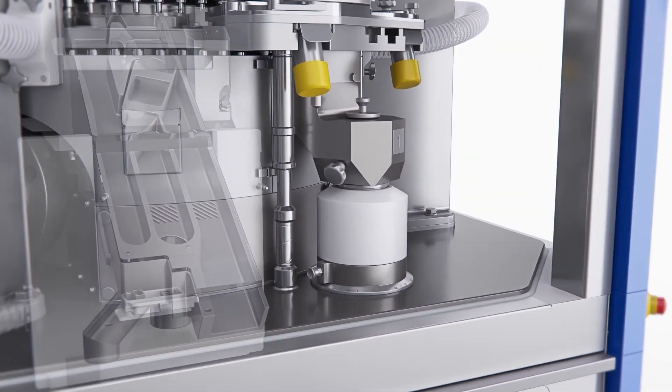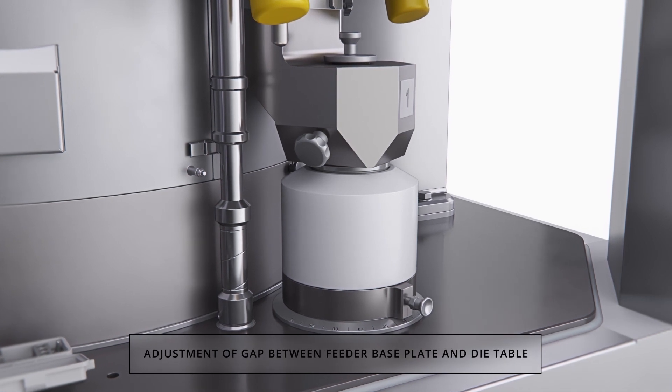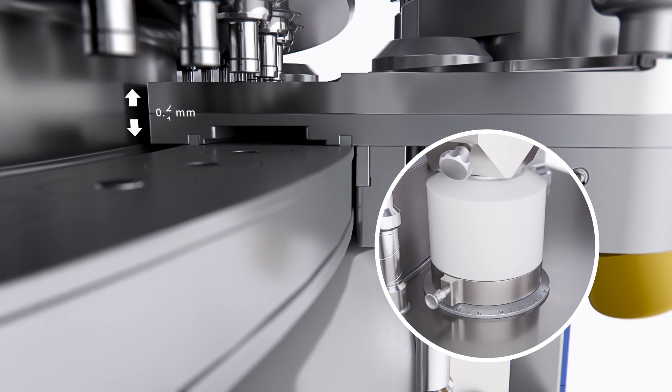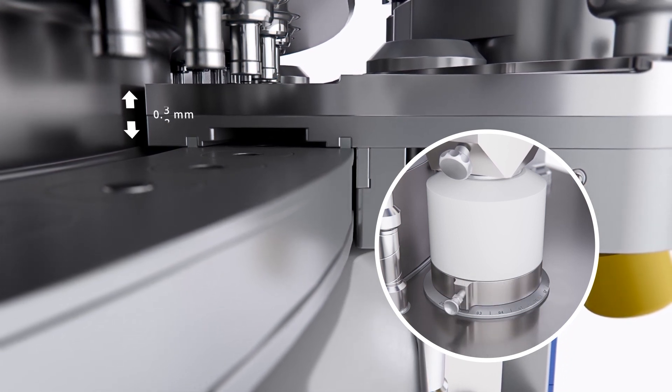A precise and simplified adjustment of the gap between feeder base plate and die table is offered as an option. This simplified adjustment ensures maximum yields for all products. The XT600.